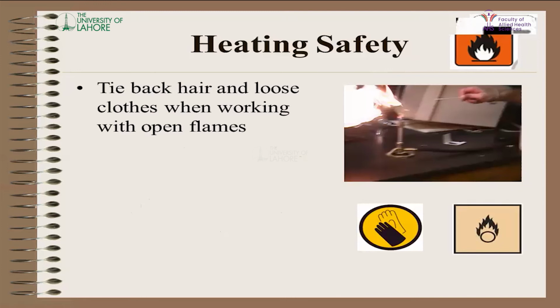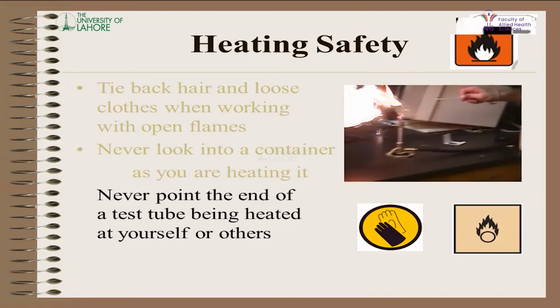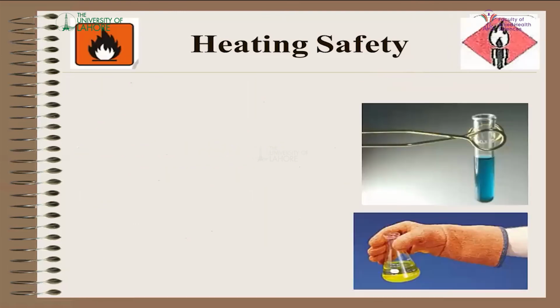Next is heating safety. Tie back the hair and loose clothes when working with open flames. Try to work very carefully when you are working with flames. Never leave the heating source unattended. Never look into a container that is used for heating. Never try to handle it without gloves. Never point the end of the test tube or any container that you are heating into someone's face, and never try to heat it in a closed container.